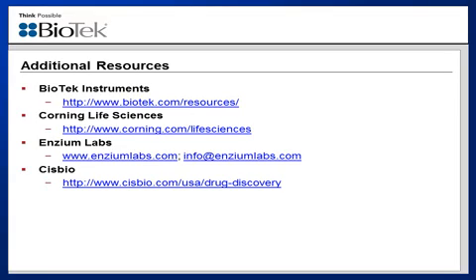So the actual amount of penetration of the light into the tumoroid structure is not going to be as complete as other types of microscopy. However, with this type of assay, we're looking at invasion that's moving out in all axes.